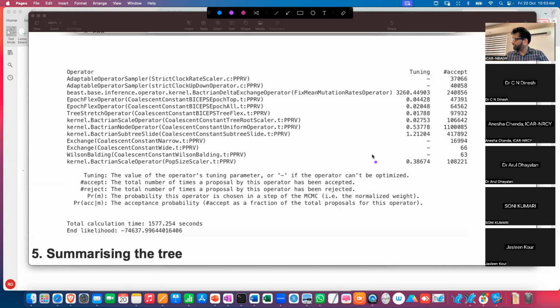All of you are here. If the offline participants are saying, which one, BEAST? Okay. Guys, any doubts still here? Do you want me to repeat any part of this? Jasleen, have you run BEAST earlier? No, sir. I have not.